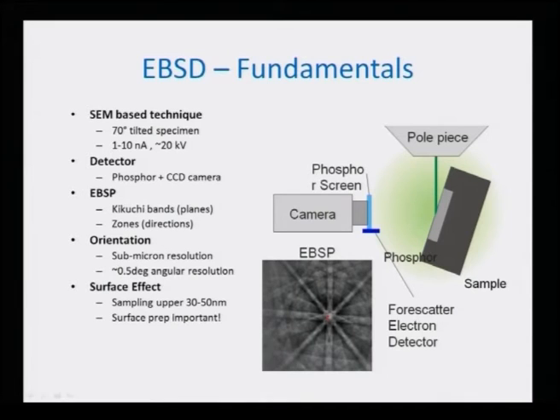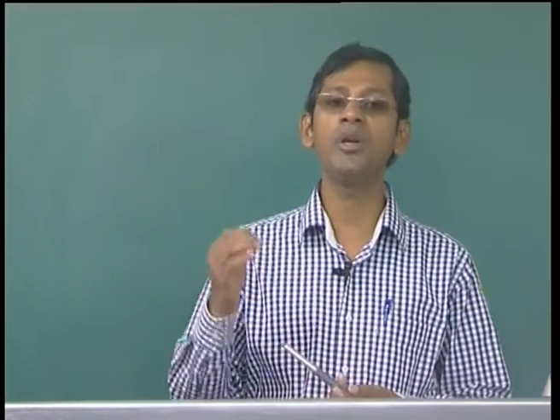and there is obviously surface information. Surface sample preparation is very important, because if there is an oxide layer on the surface, we really do not get any information from the actual crystals, because the beam will fall on this oxide layer and produce an amorphous-like pattern. That is nothing but a useless thing in an EBSD.